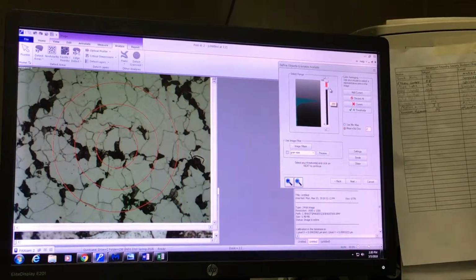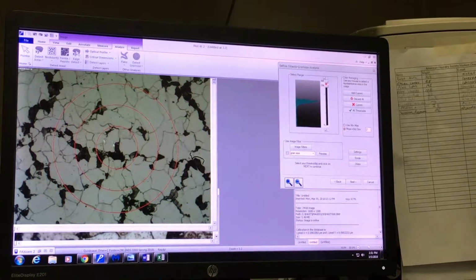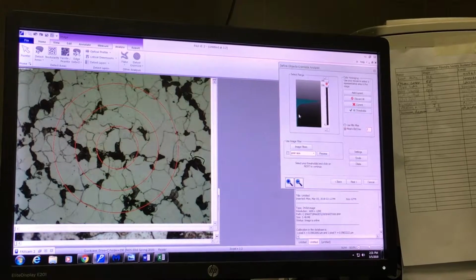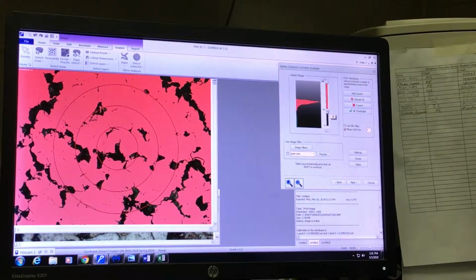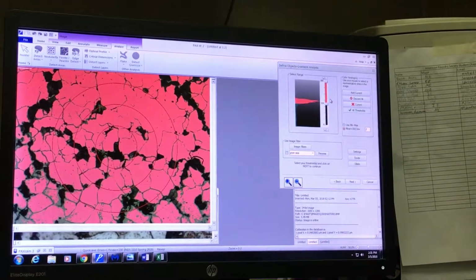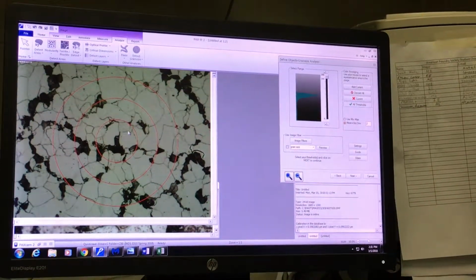So I'm just going to make sure that my threshold, I don't have any colors on here besides the color of the screen. I'll just show you what would happen if you can see it turns this pink color or whatever, and we can try to threshold that out, but we're not. We're just going to put them all up at the top there.